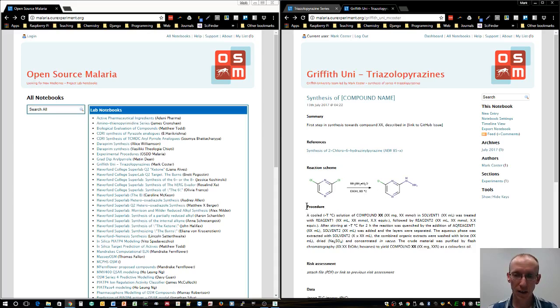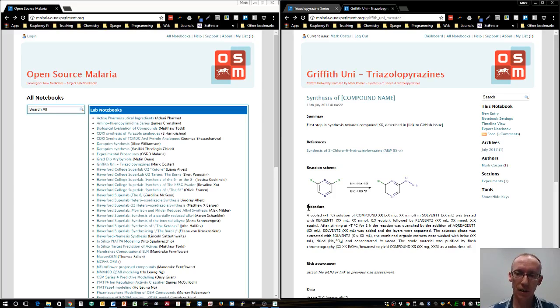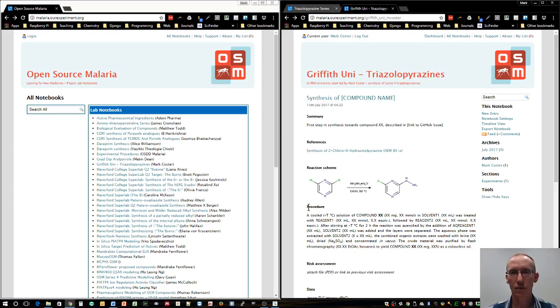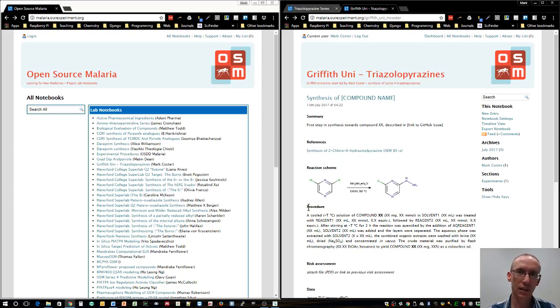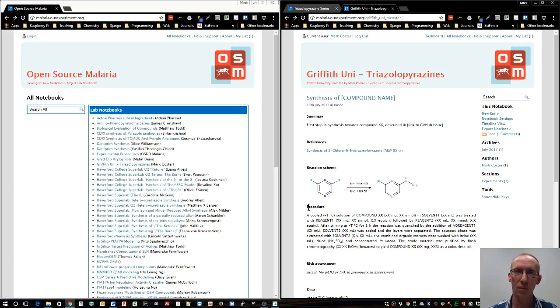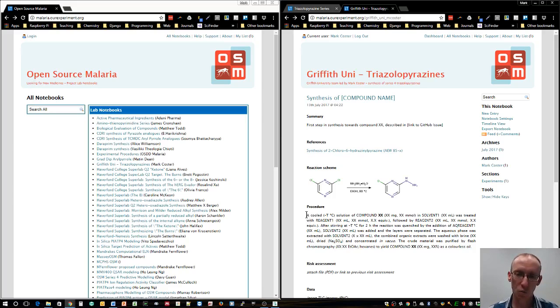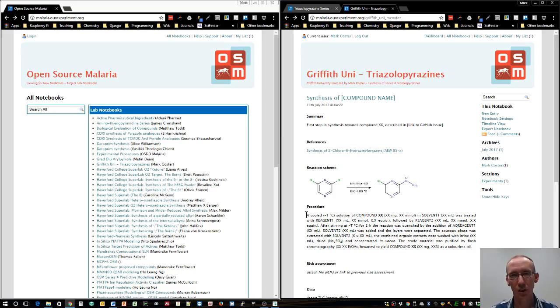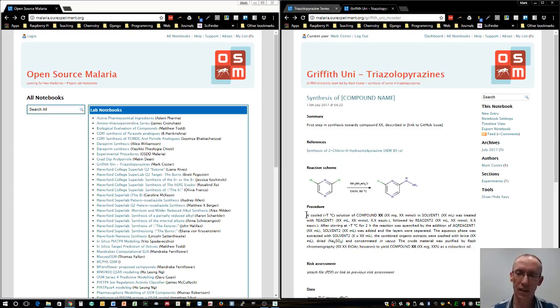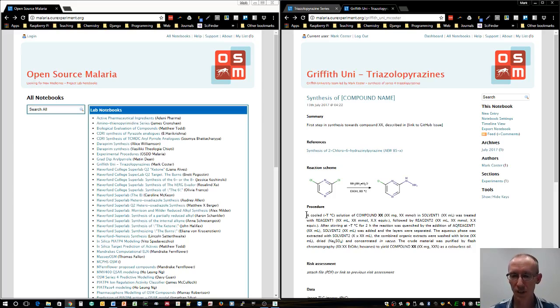I've got an example procedure. You may want to go into a lot more detail, particularly early on in your chemistry career. I've really pasted in what goes into theses, reports, and journal articles, so it's very brief and concise. It doesn't give a lot of the detail that many students will want when they're first setting up a reaction.